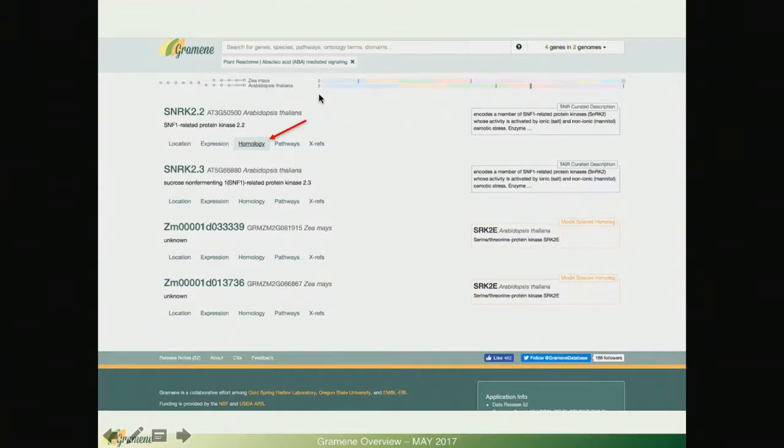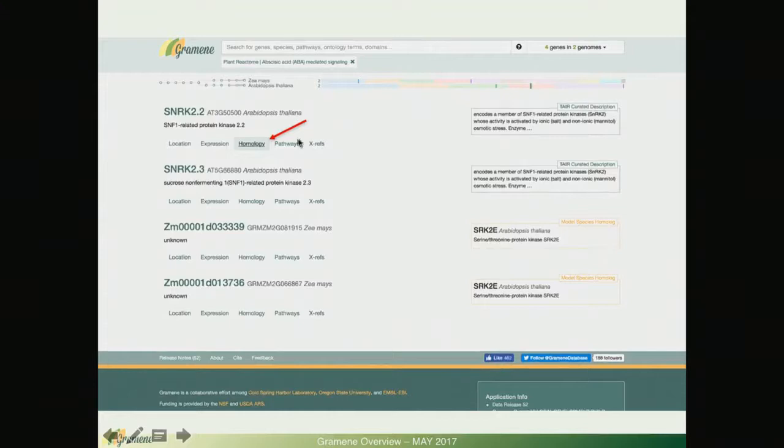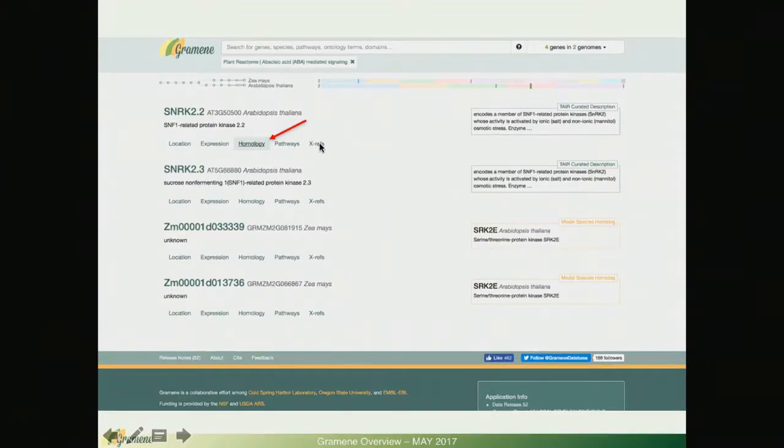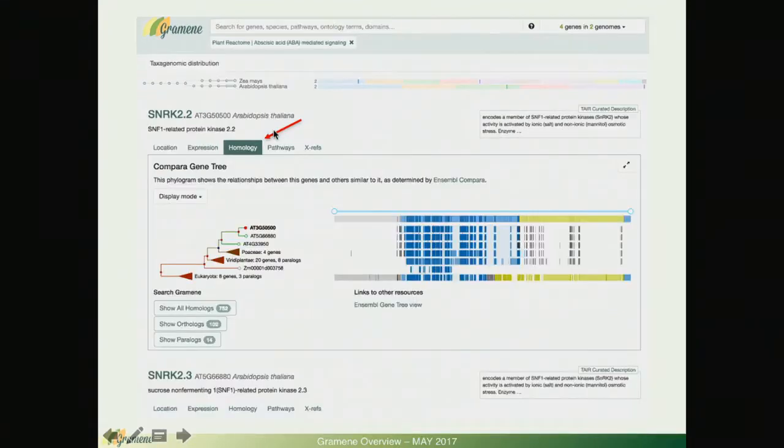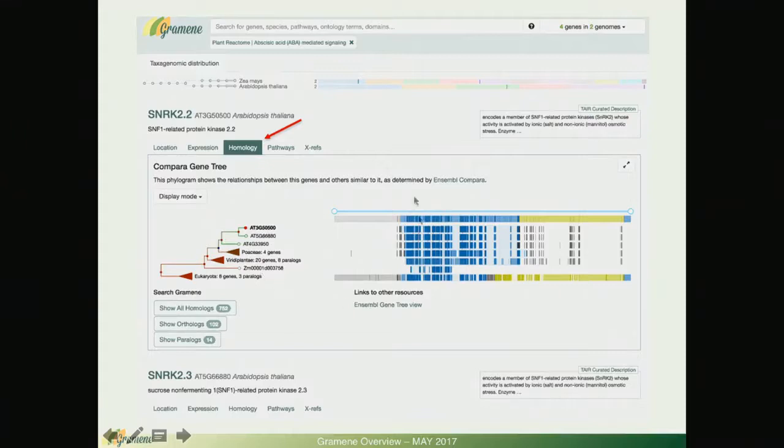Now I have that out of those 35 genes I have two genomes and there are four genes, two in each. You can see the panels that I mentioned before: location, expression, homology, pathways and cross reference on the top and I'm going to select homology.